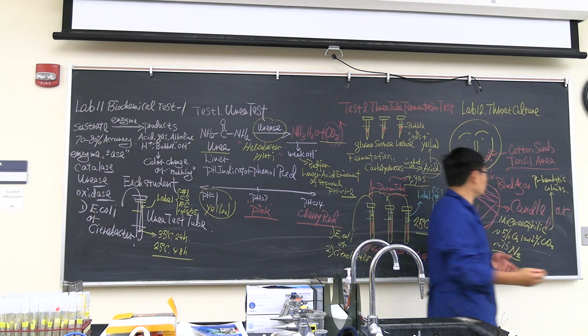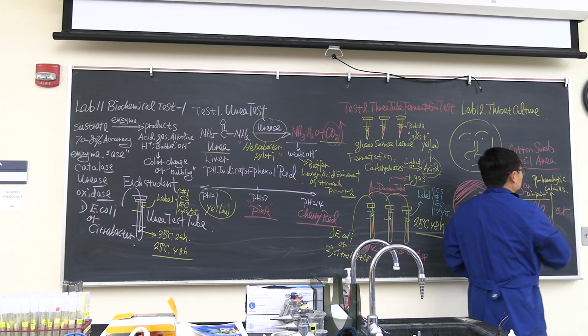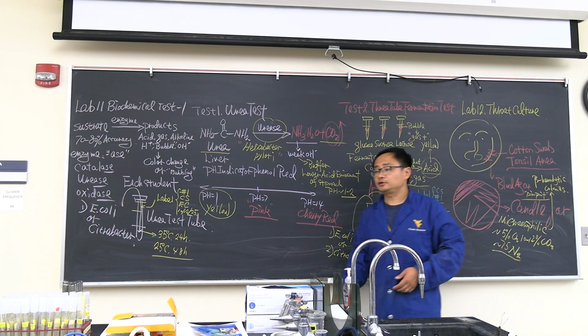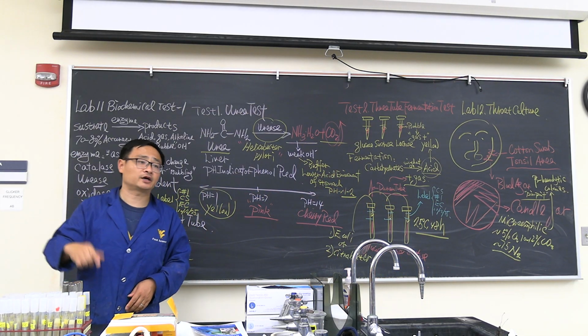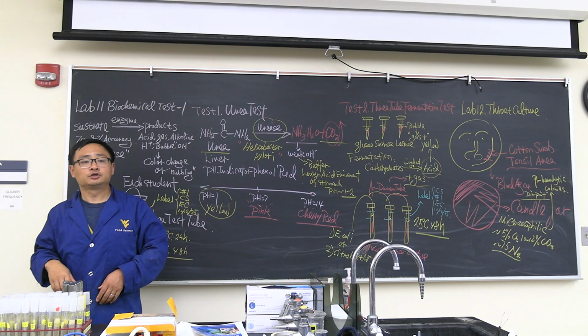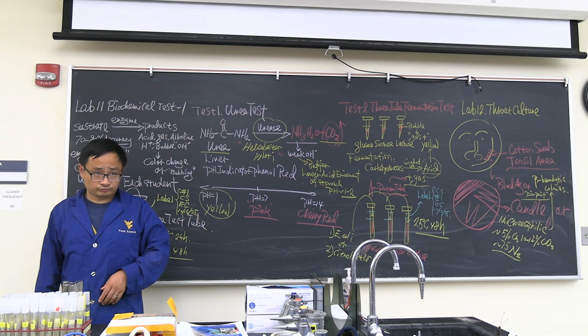And lots of these colonies we call pinpoint colonies. I guarantee you on Thursday, some of the students in this lab will find in your own throat culture you have Staphylococcus and Streptococcus. Okay, that's the work we're going to do today.